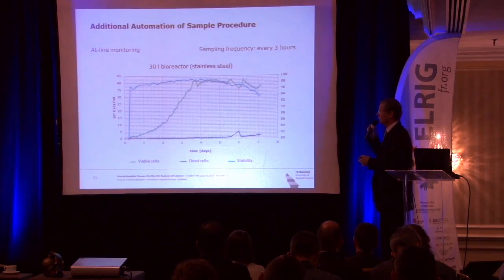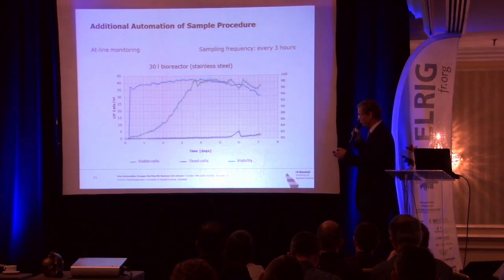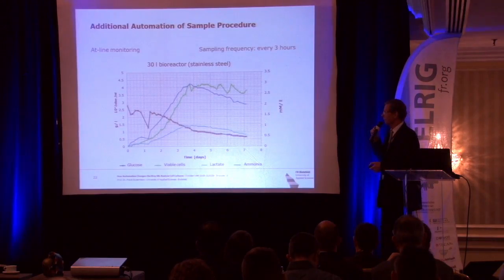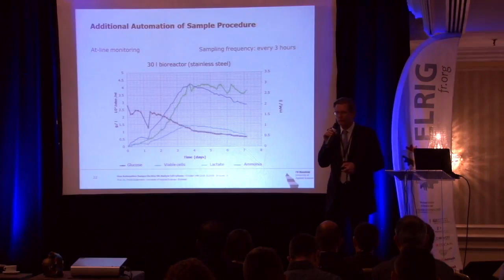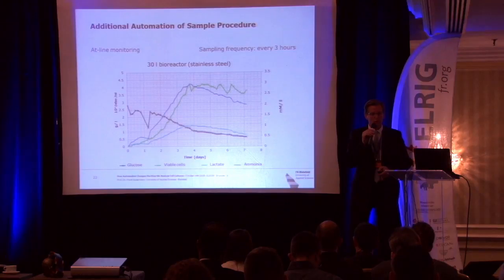There are sometimes problems for whatever reason with the technology or with the handling of the system. But here you see the cells growing, you see the viability, and everything looks nice. And you also get the data from the nutrients. Here, this is due to a mistake that we did. The analyzer uses disposable cuvettes, and of course, on Friday afternoon, we filled up the box with the cuvettes, but we forgot to empty the waste container, because the cuvettes have to go somewhere. And then, of course, the machine counts the cuvettes being used and then stops the process. And then you can see something like this. So that's also not really optimal.